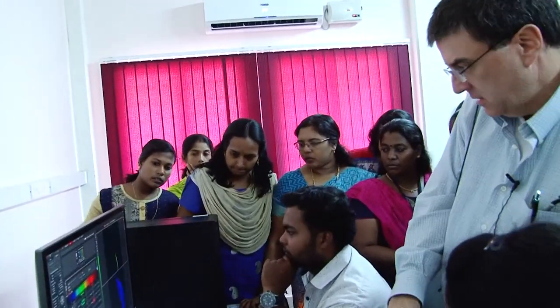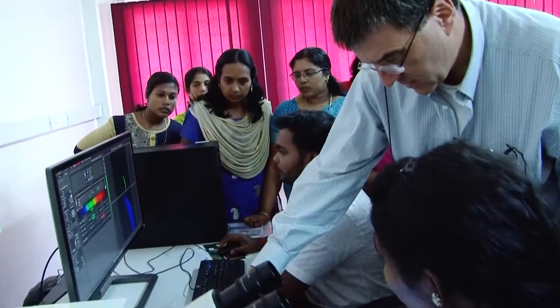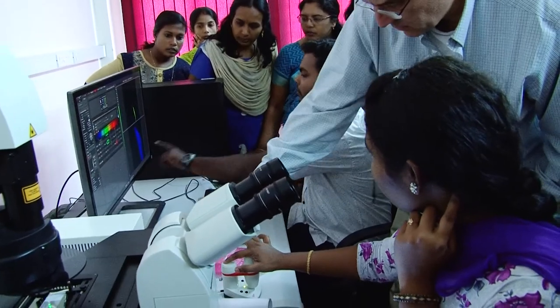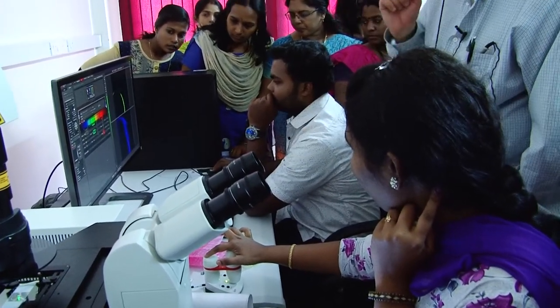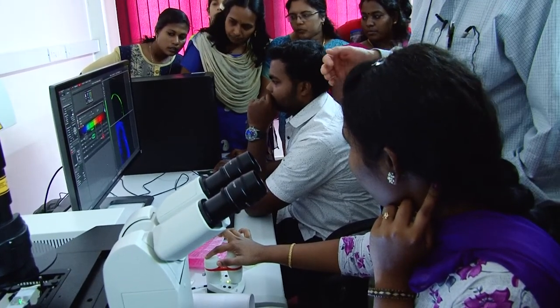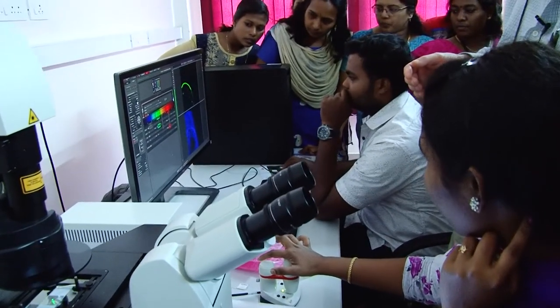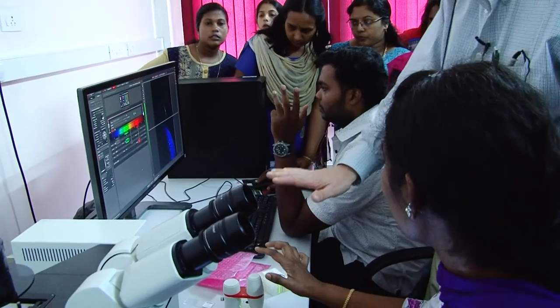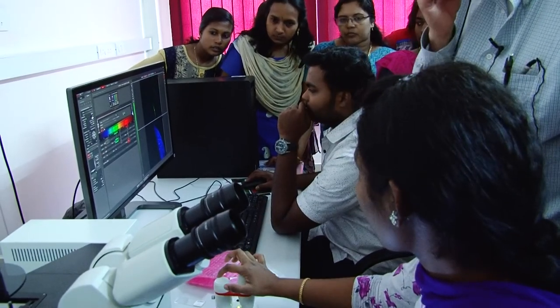All right. So you let me know when you're running live. You are. Yeah. So focus down counterclockwise. Go that way. Right. Here? Yeah. Start going that way, like against the clock. Okay. See the difference in the planes? She's going against the clock here. Keep going. Okay. And we'll call that stop. We'll call that bottom. Okay, and then go the other way and we'll do top.